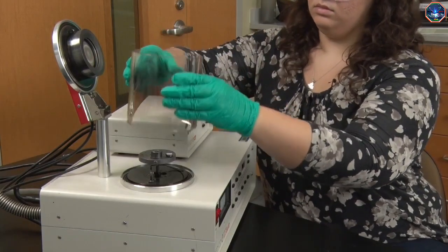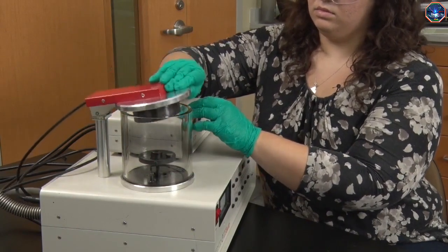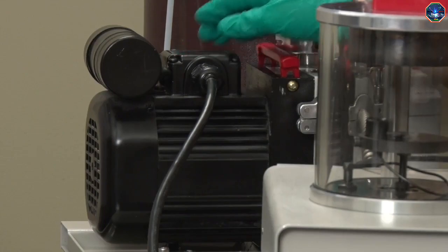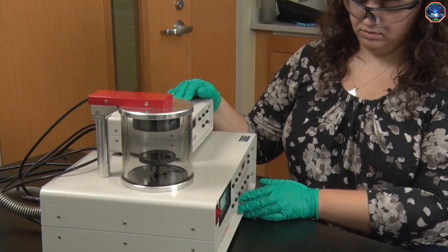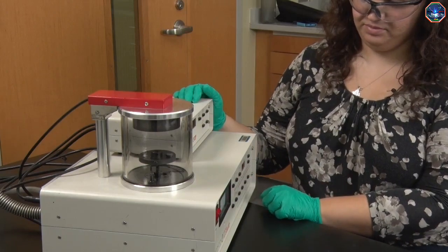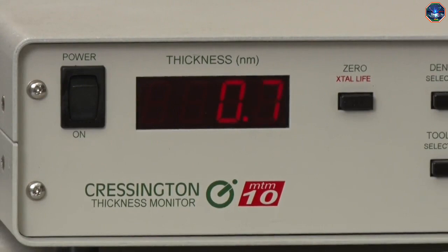After loading the sample into the chamber and closing the lid, I can evacuate the chamber using a vacuum pump. Once the chamber has been evacuated, I can start the deposition. A plasma is generated that removes material from the gold-palladium target and deposits it everywhere in the chamber, including on my sample. It's easier to see this plasma if we turn off the lights. The readout from the quartz crystal microbalance lets me know how much material has been deposited.